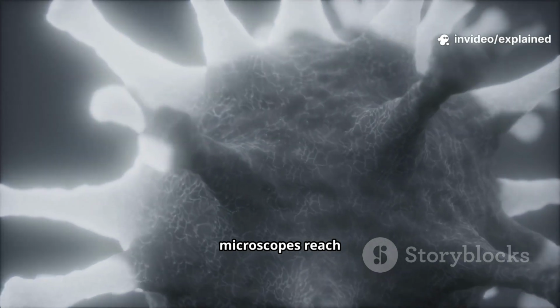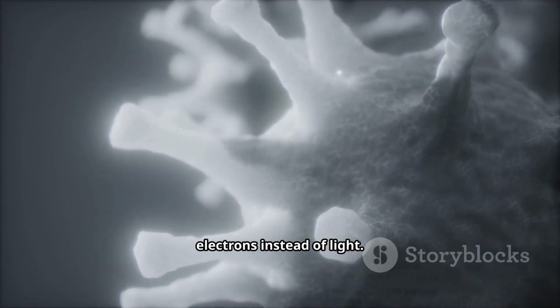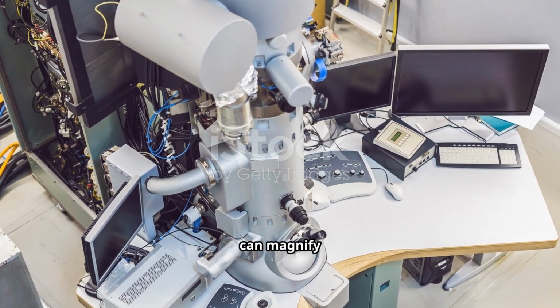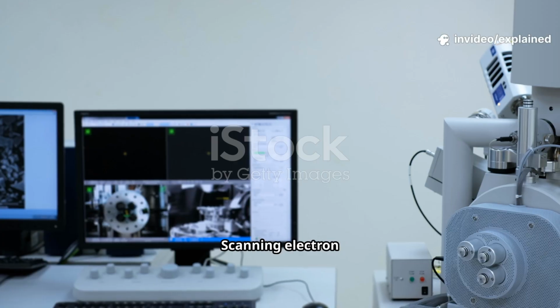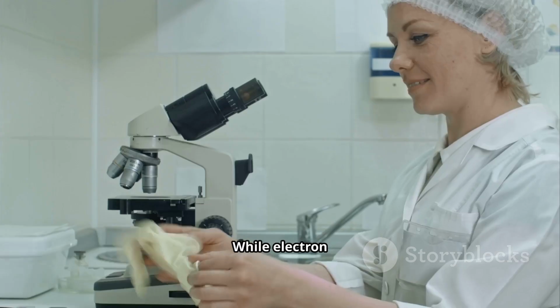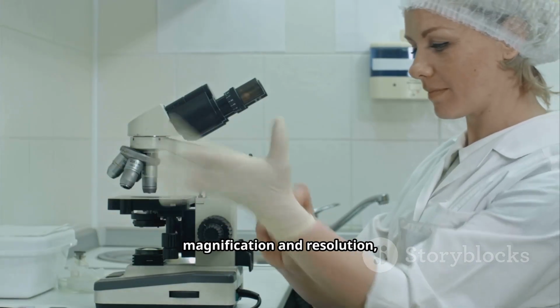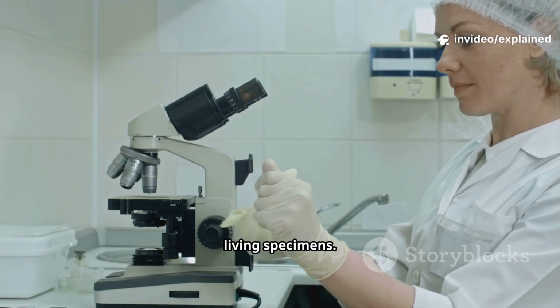When light microscopes reach their limits, electron microscopes take over, using beams of electrons instead of light. Transmission electron microscopes can magnify specimens up to 2 million times with incredible resolution. Scanning electron microscopes create detailed 3D images of surfaces at the nanoscale level. While electron microscopes offer superior magnification and resolution, they require special sample preparation and cannot observe living specimens.